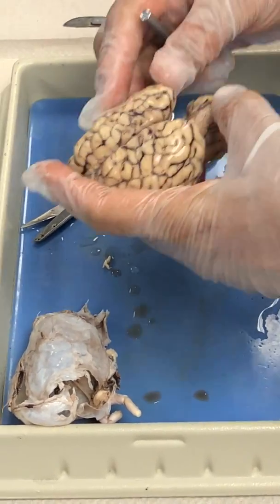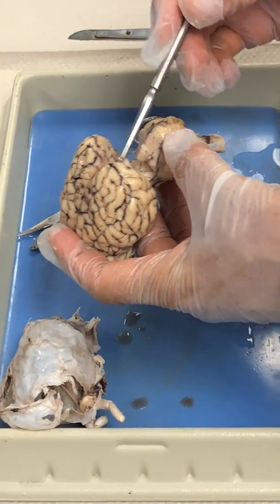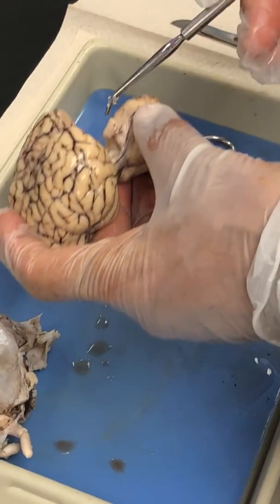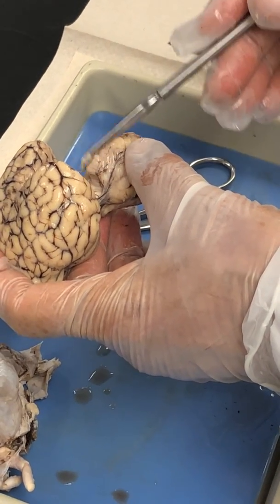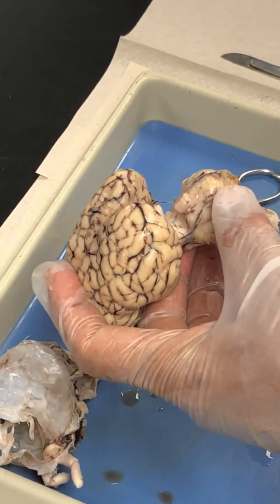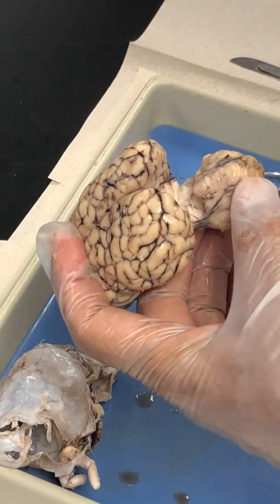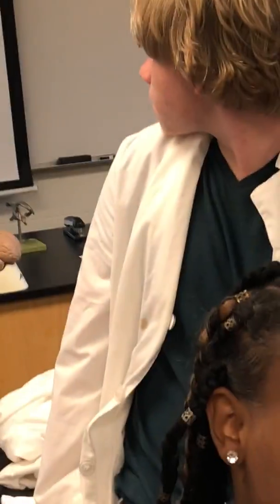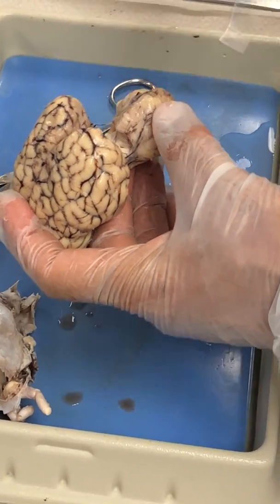When you take the sheep brain, if you carefully bend the cerebellum away from the cerebrum and look at the inside, or what's below the cerebrum, you're going to see the four rounded structures that we talked about. Those are your corpora quadrigemina. See on the right side on the screen, that's the corpora quadrigemina: the two top circles and the two bottom circles.